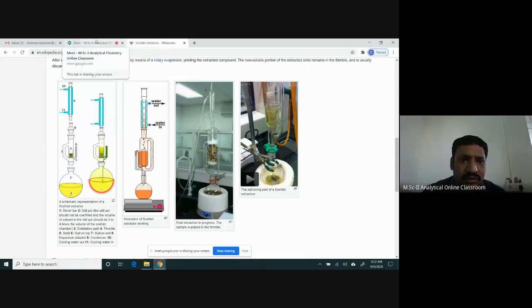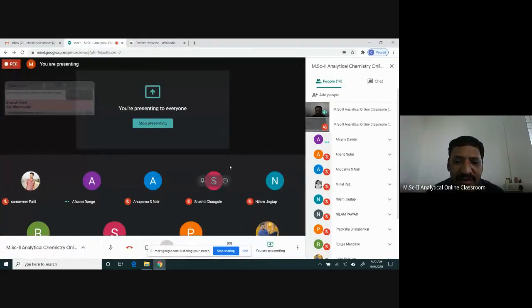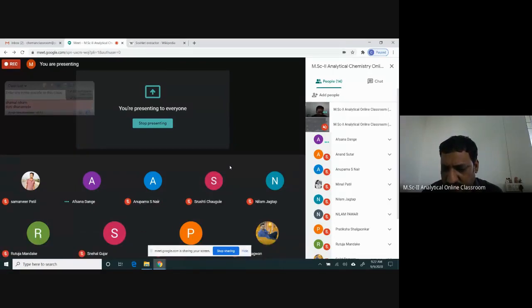Okay. So if you have any question, please ask me about this. So we take two methods, that is, simple filtration with vacuum and Soxhlet extraction, through which we want to separate and extract the plant pigments from natural sources.